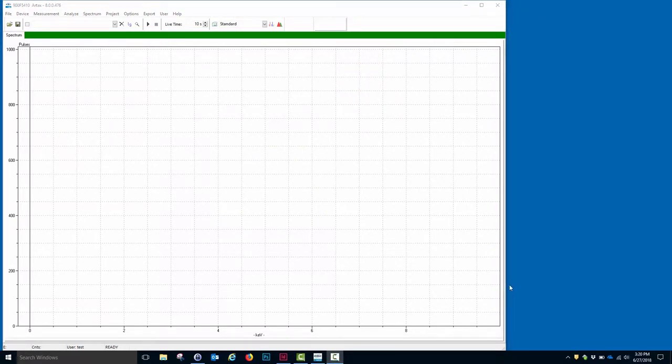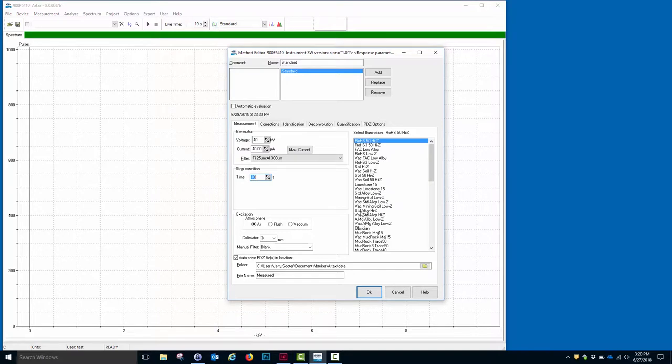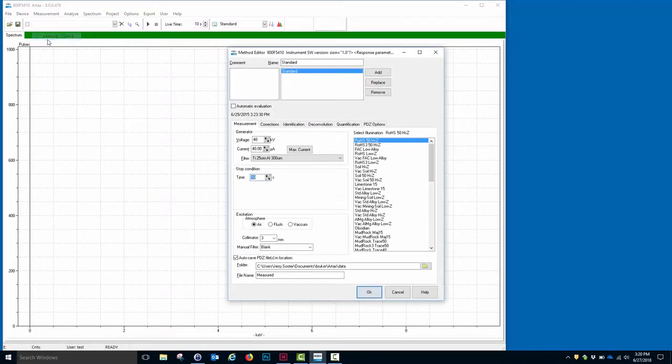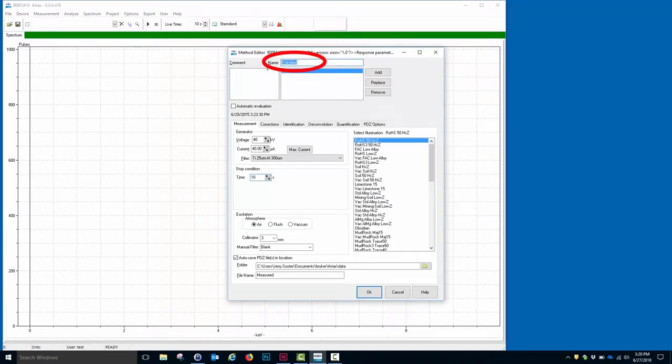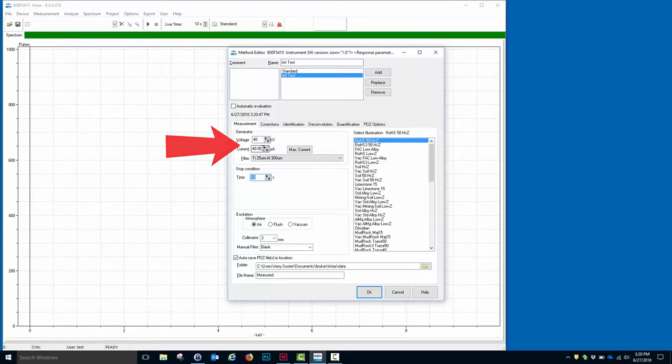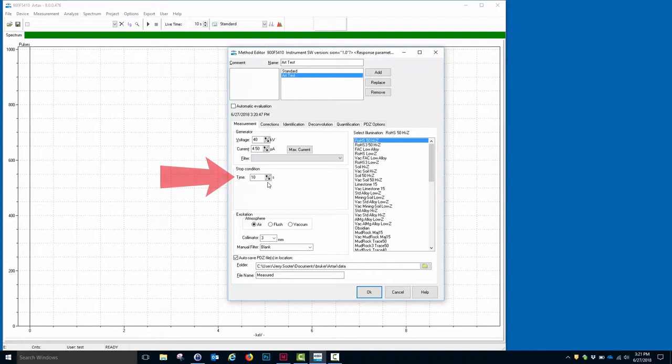Next, we want to establish a method. We can do this by either clicking on the Methods box or by going to Measurement Method. In this box, we want to create a new method, and we'll call it Art Test. I click Add to add a new method. Now I want to set the current and the voltage, and I'll set the voltage at 40 kV, the current at 4.5 microamps. I want no filter, and I'm going to use 10 second acquisition time.